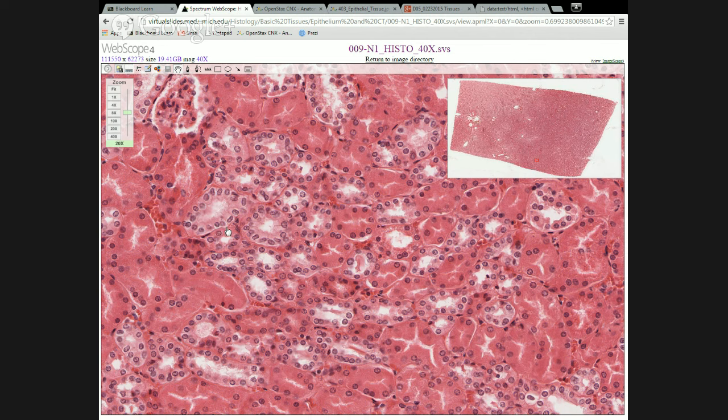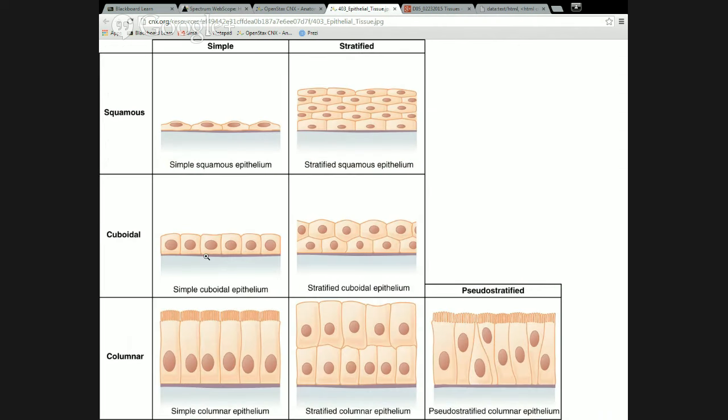That's because the basal membrane of each of those is kind of up next to each other, so they stand out pretty well. So imagine if we took two copies of this and put them back to back to each other. That dark line at the basal edge of each of those cells next to the dark line of the basal surface of all of the other cells in the next one, it would really kind of stand out like I just pointed out there.